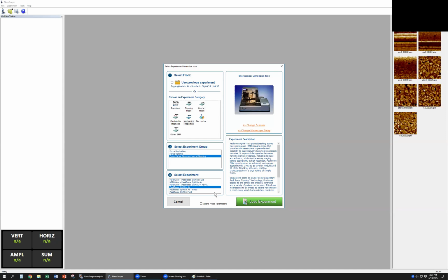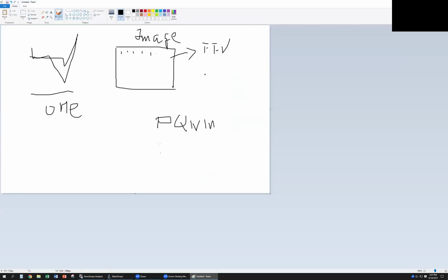All these methods are similar, so that means we need the same kind of parameters. The first parameter is called F, for the Hertz model. Today we are talking about the Hertz model and the Sneddon model, and they are different applications.